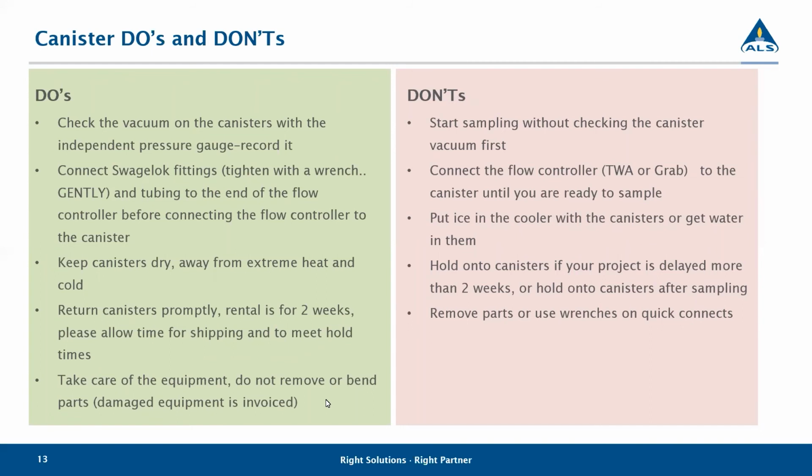These are pretty straightforward. We don't need the canisters chilled. Don't put ice in the cooler with canisters. We don't want them to get wet. They don't have to be stored in a walk-in fridge. They can be stored at ambient temperature.